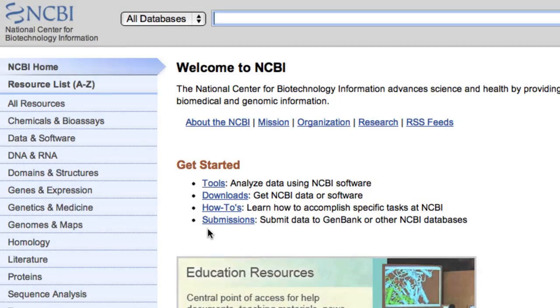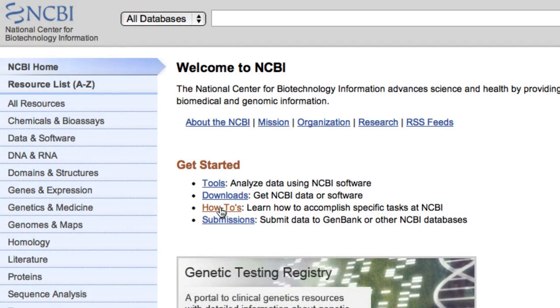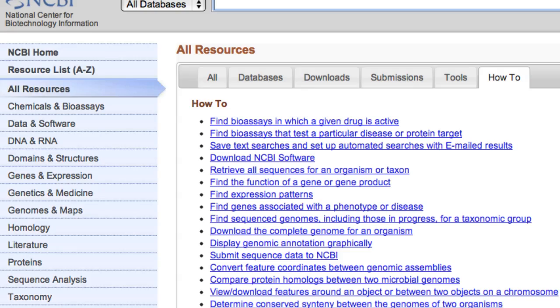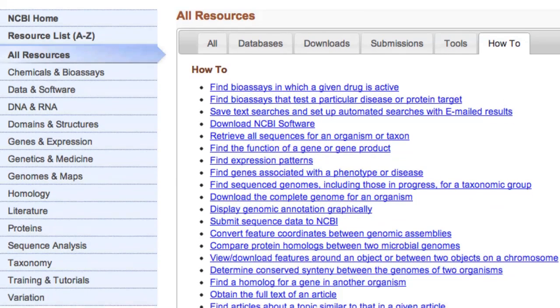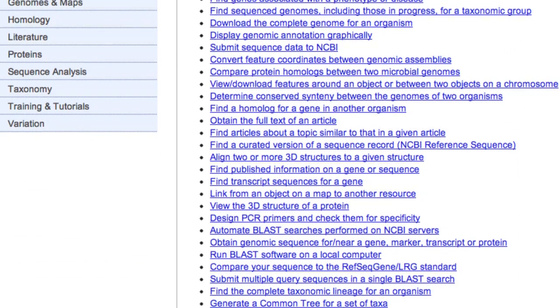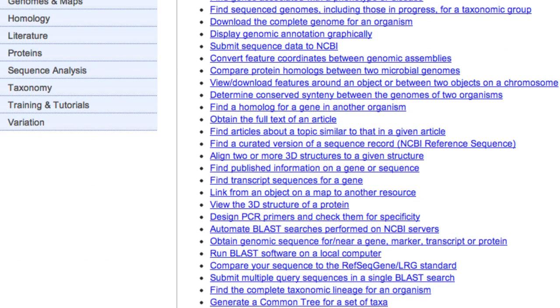This tutorial describes part of the how-to called Obtain Genomic Sequence for or near a gene, marker, transcript, or protein. I'll focus on obtaining sequence for and surrounding a gene.